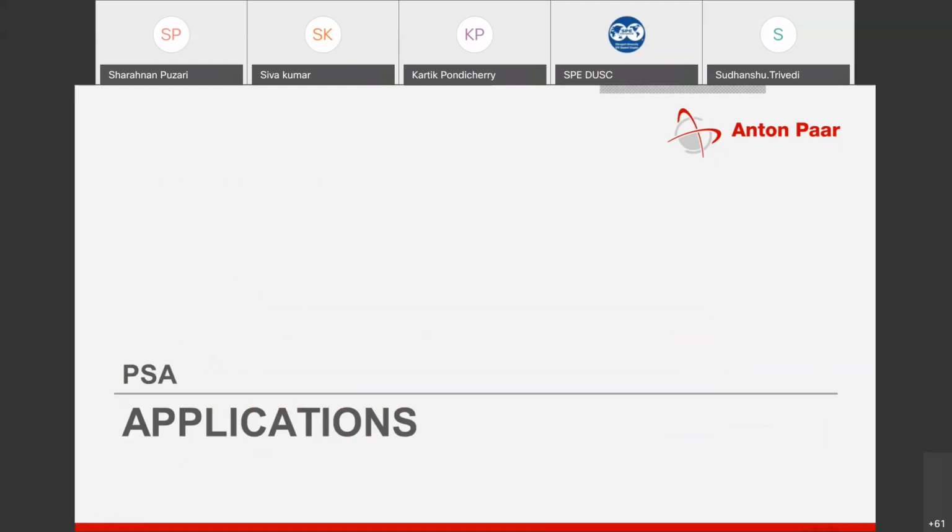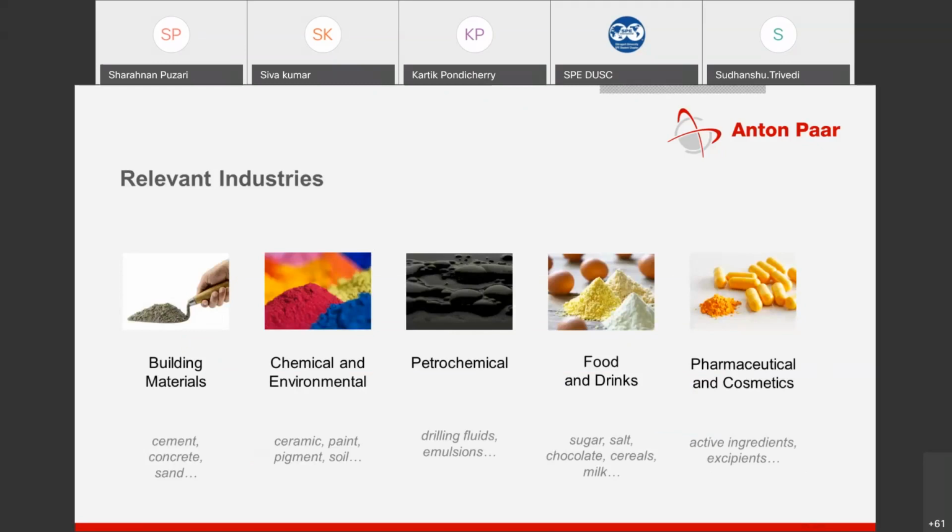Now coming to application, I have not given a very big presentation. It's a small compact presentation, and I try to keep it short and clear. So when I say application, you name the application where particle size is required, like building materials. In building materials, I would say cement is the biggest application.